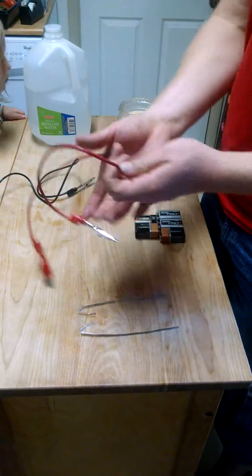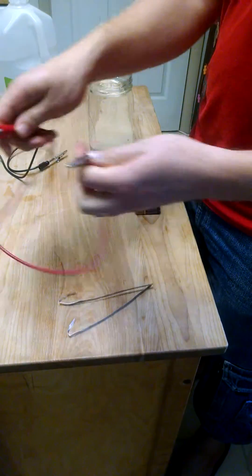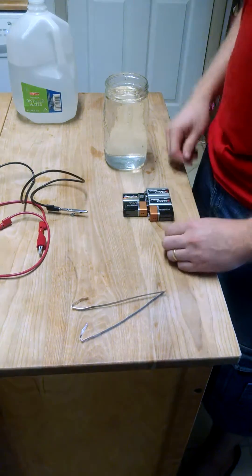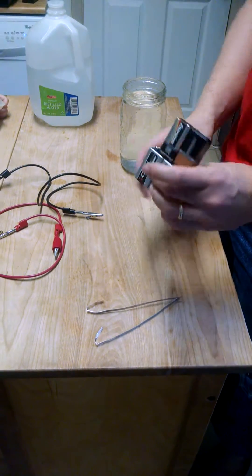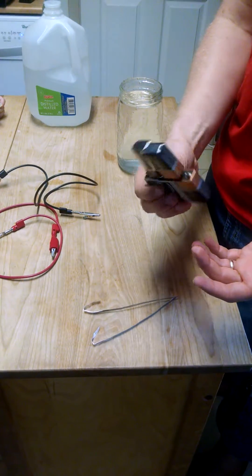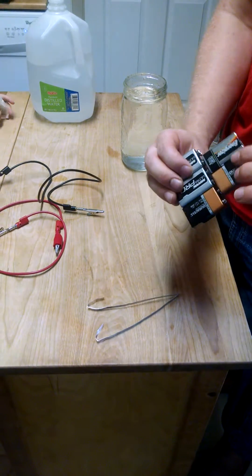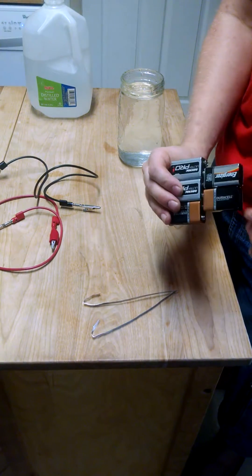You'll need some wires with gator clips. You need two of them, one for your positive and one for your negative, and batteries. You only really need three batteries. These are starting to get old, so I just added on some more, and then the more batteries you put on, the faster it goes.